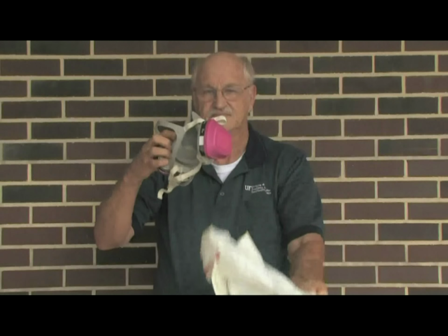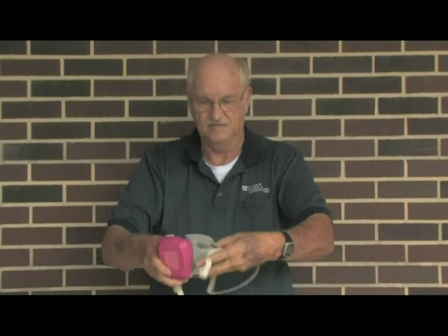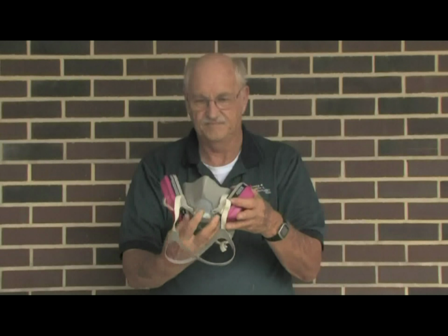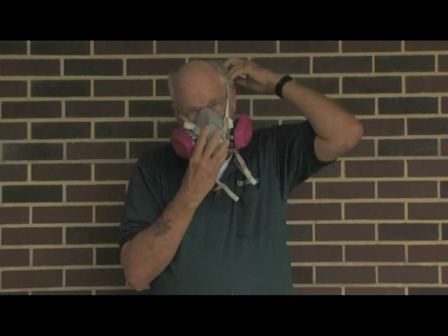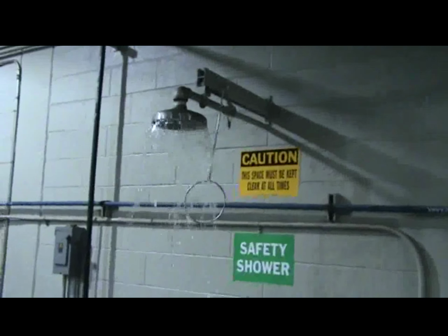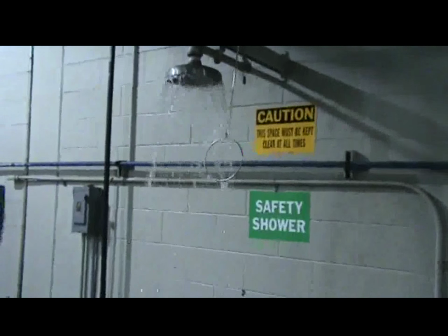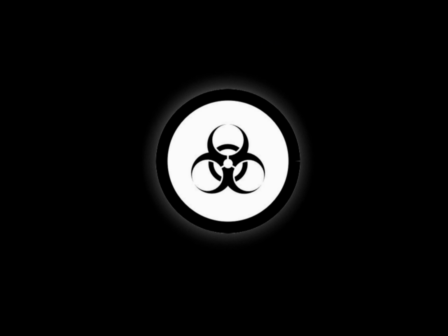Therefore, you should wear the proper protective equipment, including eye, face, and hand protection and protective clothing. Wear the proper respiratory equipment and work in well-ventilated areas. Wash thoroughly after handling the material. Store the material in designated areas only. Here's another symbol you need to be familiar with.